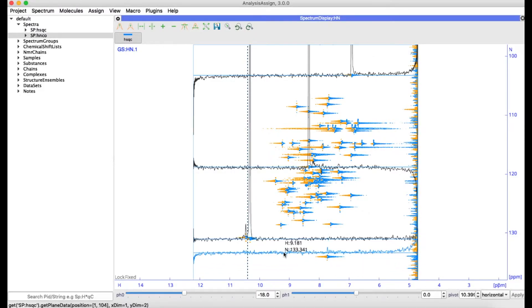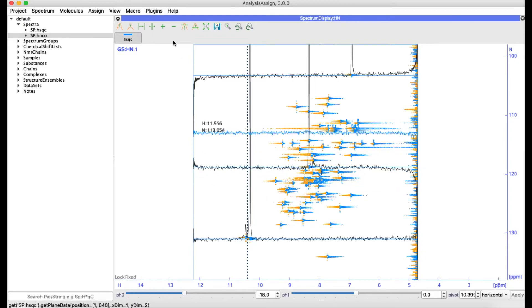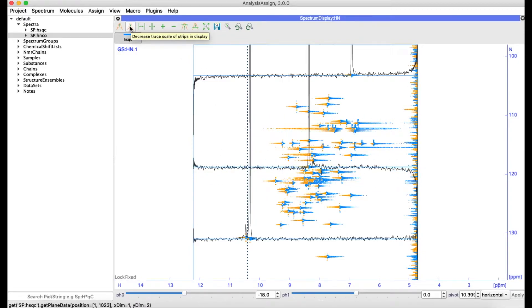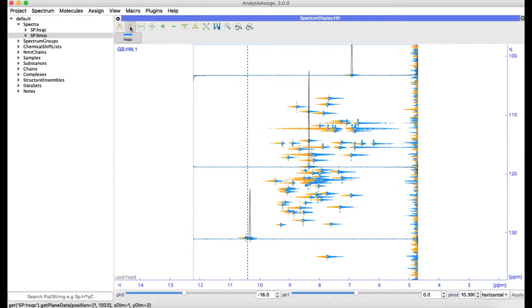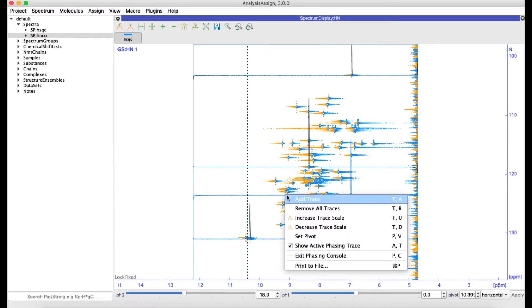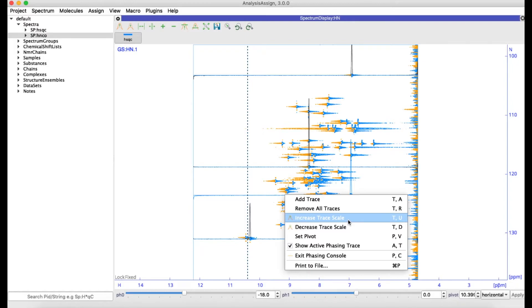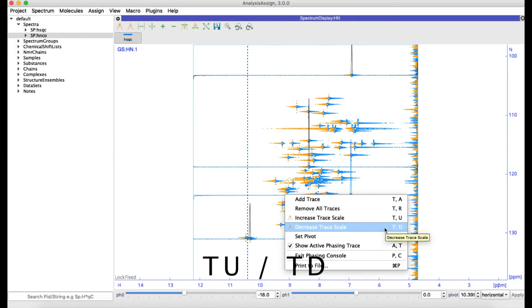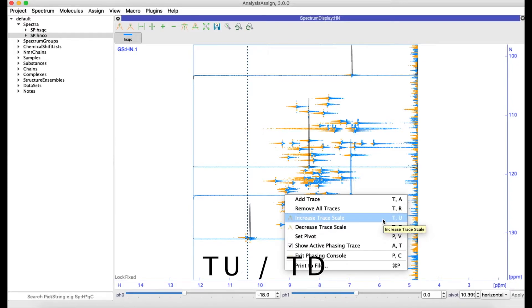If you want to scale your traces, you can do this either using the buttons in the toolbar or using the right-hand mouse menu using Increase Trace Scale or Decrease, or the shortcuts TU and TD for Trace Up and Trace Down.